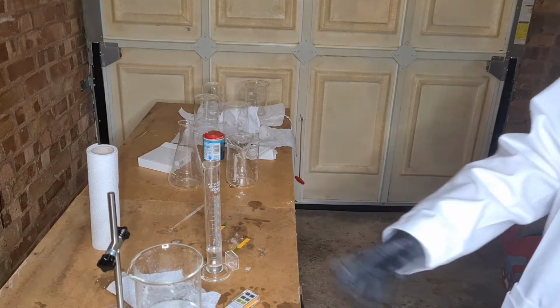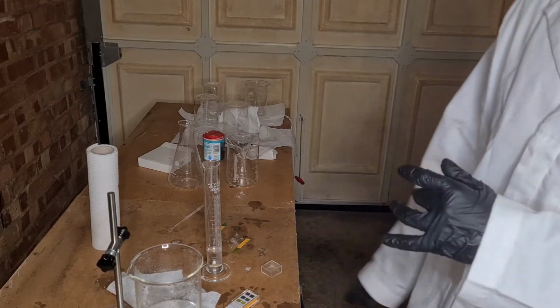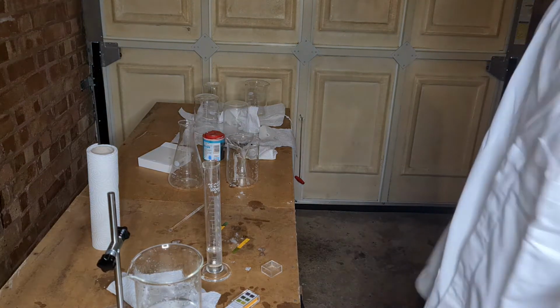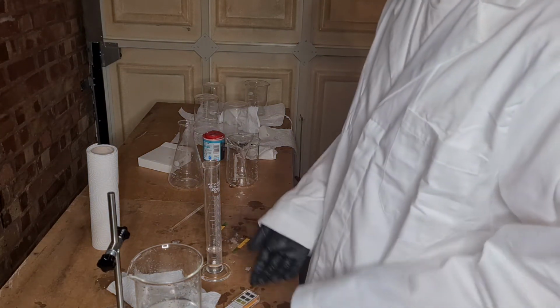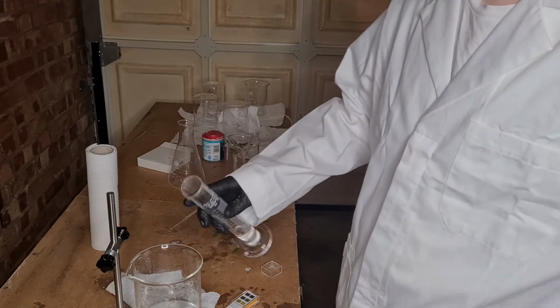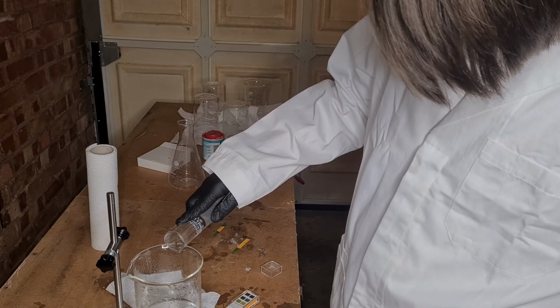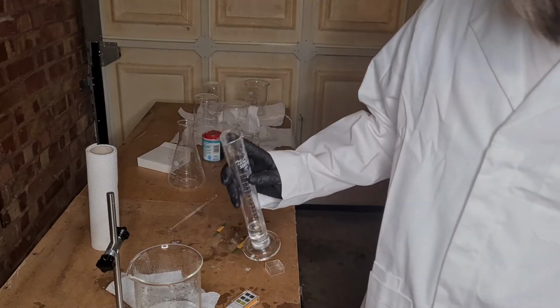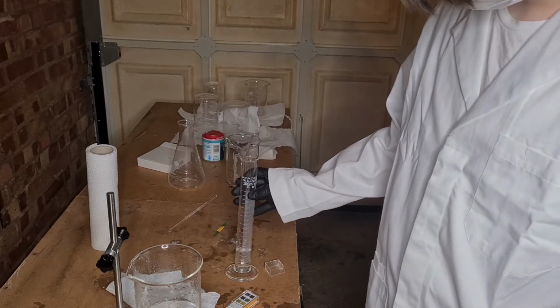As I'm not entirely sure whether or not this is fully neutralised, if I had a pipette, I would have taken a small sample of that. However, I do not, so oh well. What can you do? So, provided this is theoretically just sodium chloride solution, you need to make sure there's no sodium bicarbonate. So I'm not sure if I want a tiny bit more of this, because we need to react everything in here. Obviously I don't want to be boiling off hydrochloric acid later, that would not be very fun.